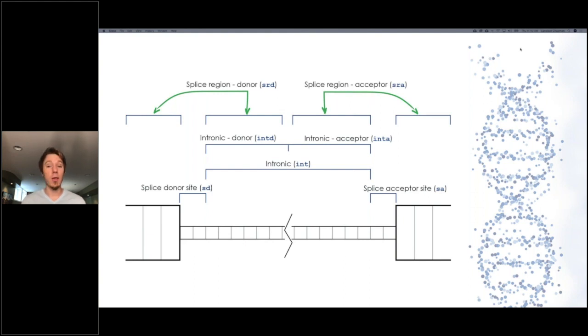Going back to the idea of maximizing sensitivity and then optimizing specificity, this is an example of one of the things that we've added within the past month, particularly for non-coding variants. Mark and Rachel showed you how you can search by cDNA nomenclature or genomic coordinates or RSID, which are all nucleotide-specific nomenclatures for variants.